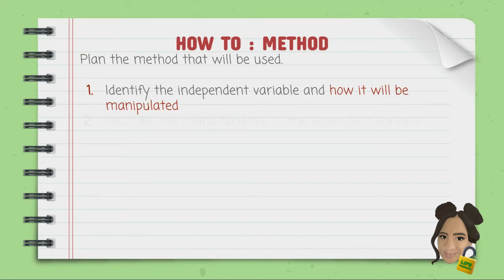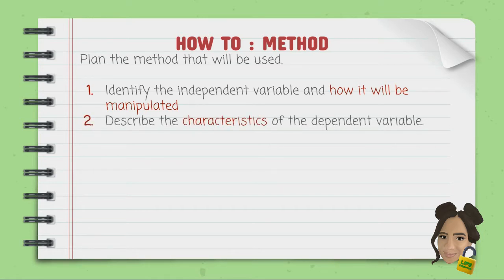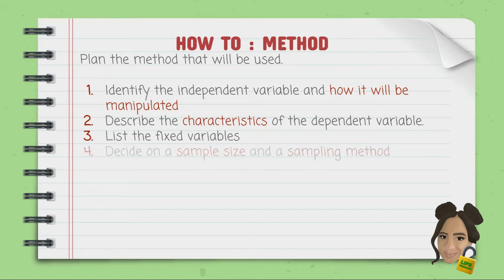Our chosen method is using the potometer, and your sample size is dependent on how many plants you'd like to test your hypothesis on. So if you wanted to do this experiment with a sunflower and a daisy, you'd need 2 or more of each flower, while as many of each as the amount of categories you'll be testing.